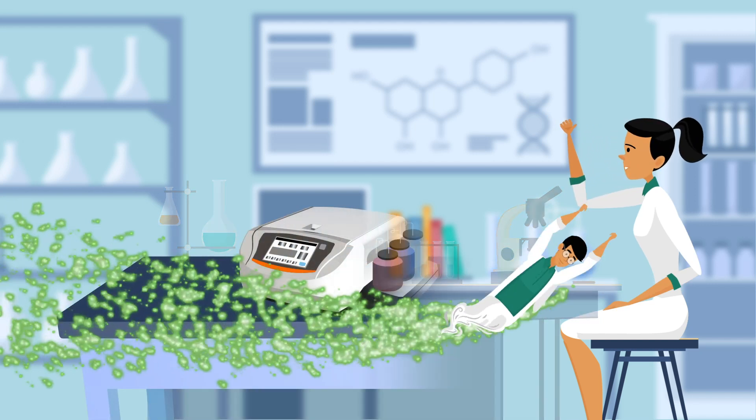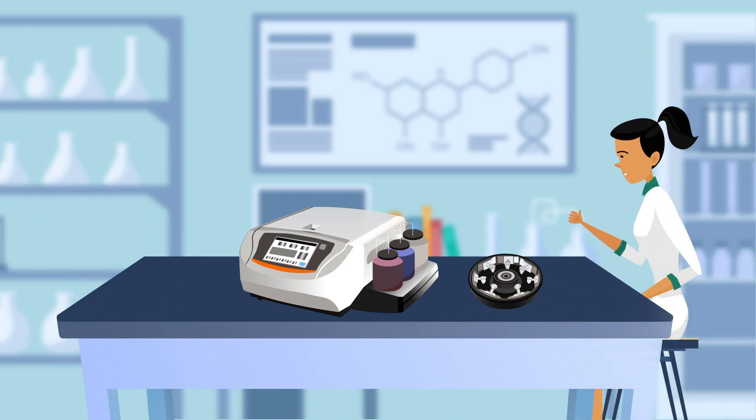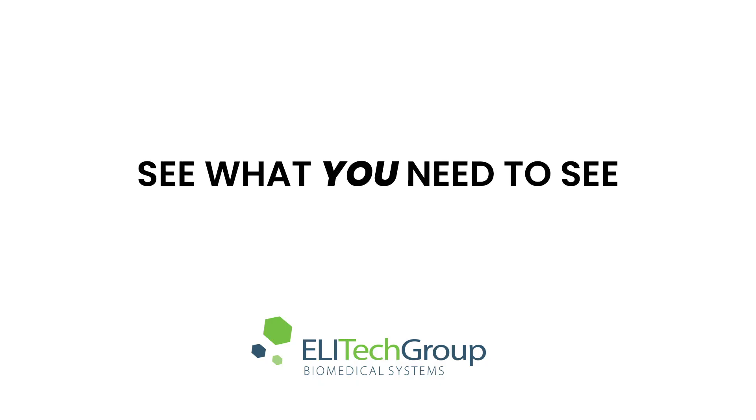If you're wishing to enhance the reliability of your slide staining and want quality results in less time, the Aerospray Pro slide stainer and cytocentrifuge is everything you can wish for and more. See what you need to see — AerospraySstaining.com.